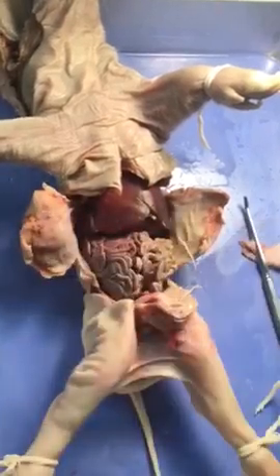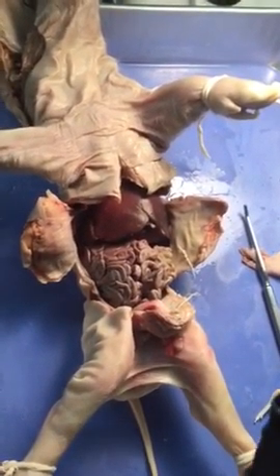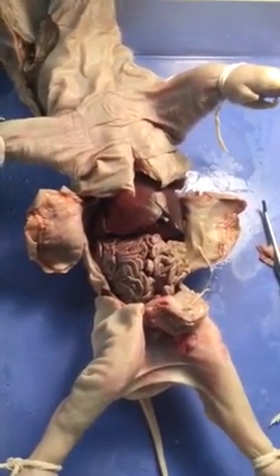It doesn't form individual sacs, like with the heart, with the pericardium, the parietal pericardium. So the parietal layer lines the whole cavity, and then the visceral layer is found right on the organ.